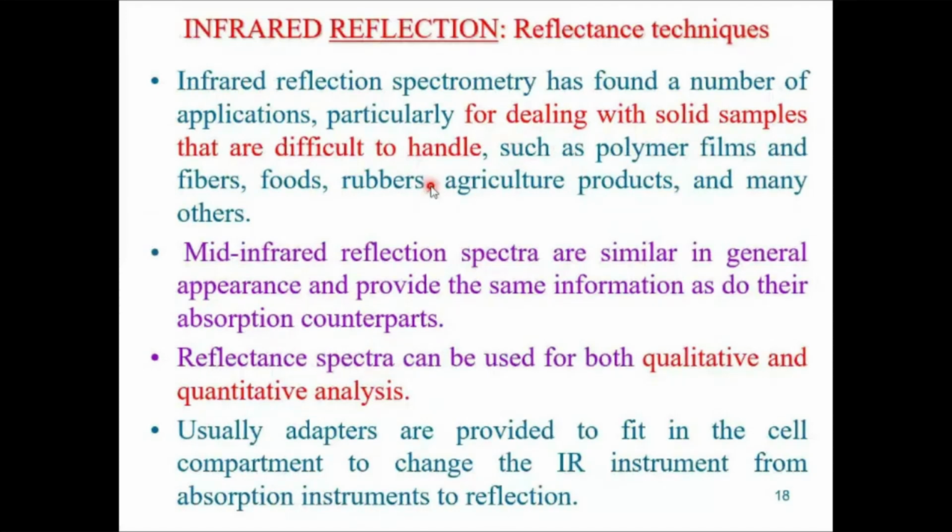Now coming to the reflectance techniques in infrared. It is called infrared reflection spectroscopy. Infrared reflection spectroscopy has found a number of applications, particularly in dealing with solid samples that are difficult to handle, such as polymer films, fibers, food, rubbers, agriculture products, and many others.